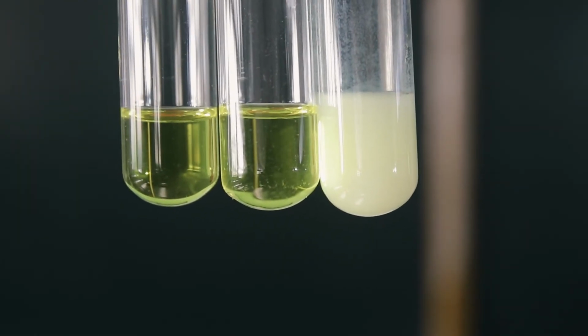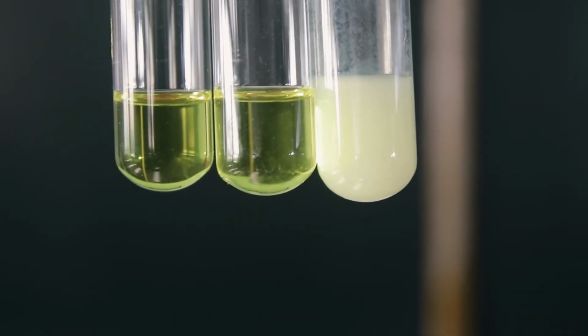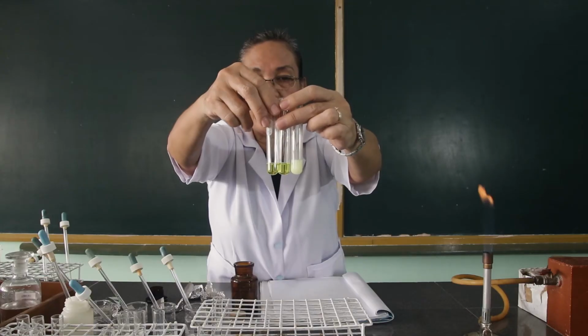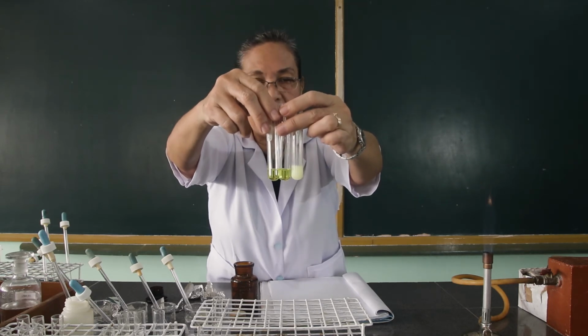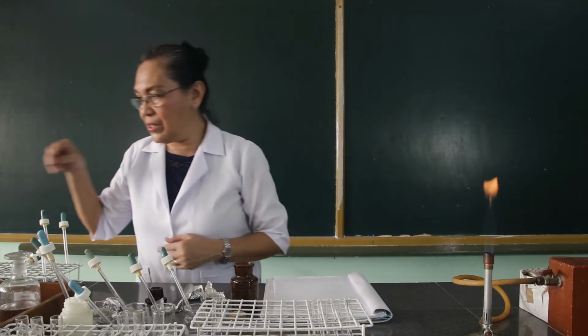If you're going to think about it, that means you can tell which of the group 4 cations can precipitate with potassium chromate. Then the same procedure is to be followed, but we are going to add first the acetic acid before we add the potassium chromate. So again, let's get the different ions.